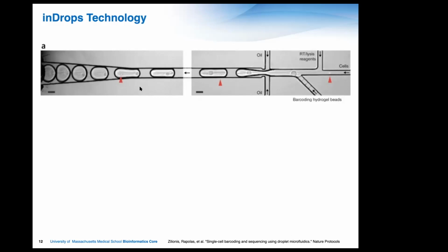In these droplets, there are chemicals that make it so they don't merge together or coalesce, so they remain discrete emulsions. If you've done or heard of emulsion PCR, which is a pretty old technique, it obeys the same principle. You have these small isolated droplets, and in every one of them you have an RT reaction going on, isolated from every other droplet. Each one of these droplets has its own single cell in it. And in parallel, you're doing this RT reaction in thousands or tens of thousands of cells at a time.